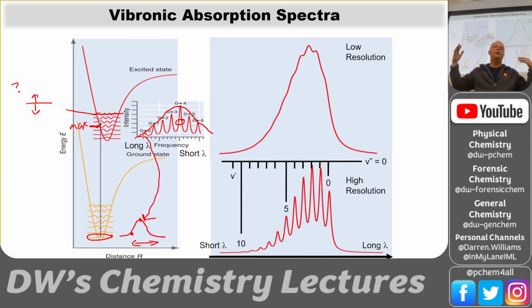But not all the molecules are in the midst of a collision. Most of them are in their unperturbed state, but you have collisional broadening. That's one of the things that you can see. And so that's something that causes these individual absorptions to be broad. So you could have collisions. What else could you have?